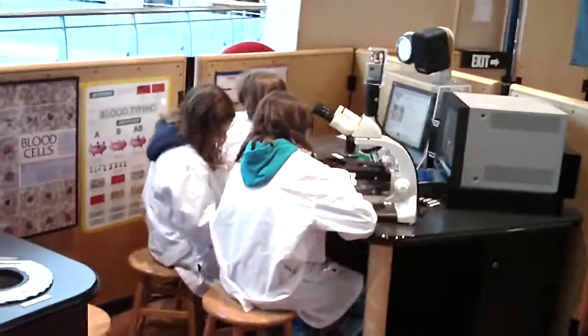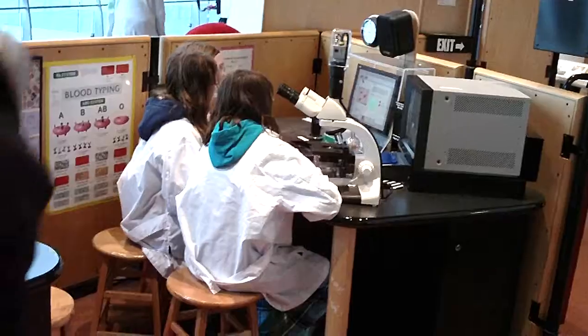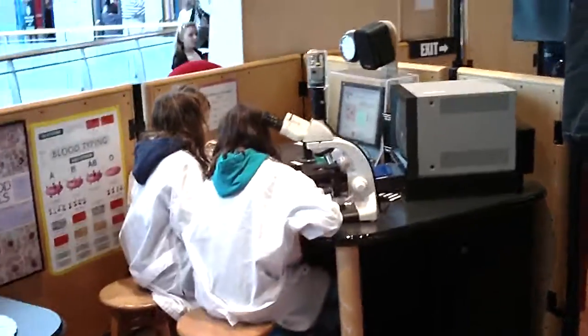We've got a few kids on the end here at the examining blood bench. They're doing one experiment because we don't have the other supplies.